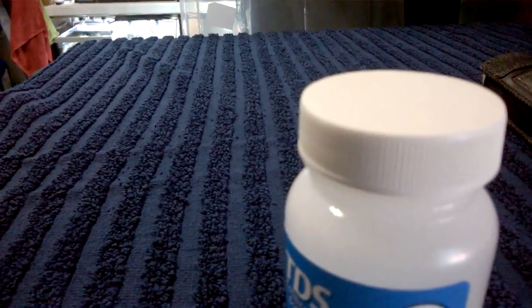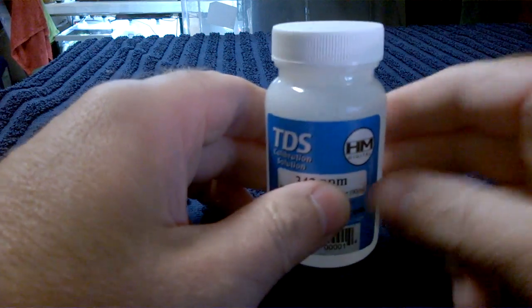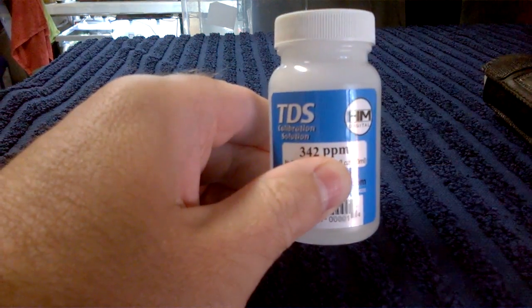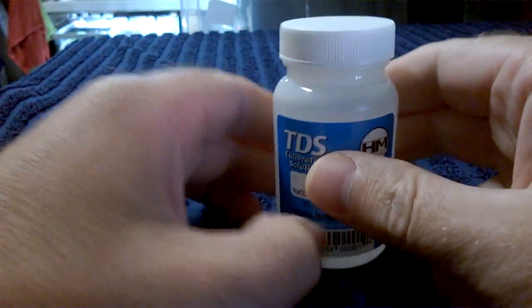So this is how you do it. You have your TDS fluid — and I'll just double check that's in focus for you — there it is: 342 parts per million.